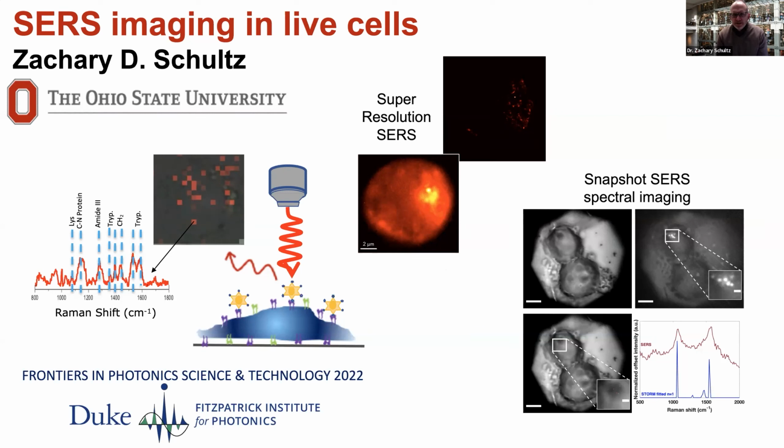Had some great introductory lectures about SERS and using it for diagnostics. Duncan even talked a little bit about imaging. I'm going to combine a little bit of that, and we're going to talk about SERS imaging in live cells today. Maybe even allude to some things that might help address some of those questions we had earlier about location of reporter molecules in cells. That's where we're going. All right, so let's get started here.